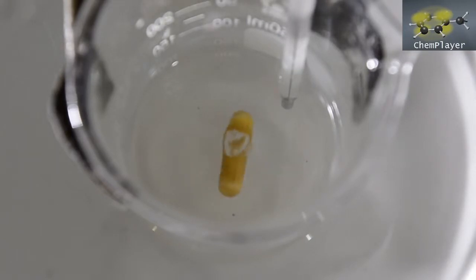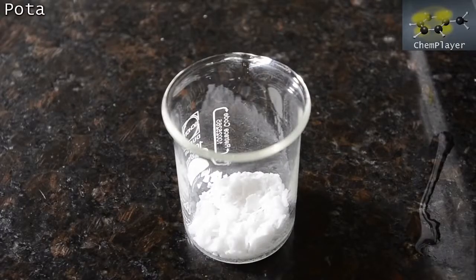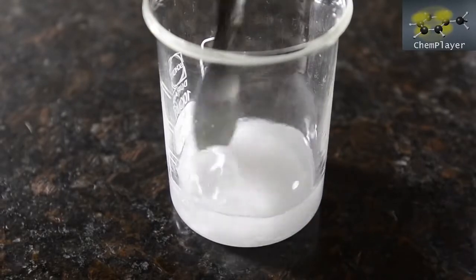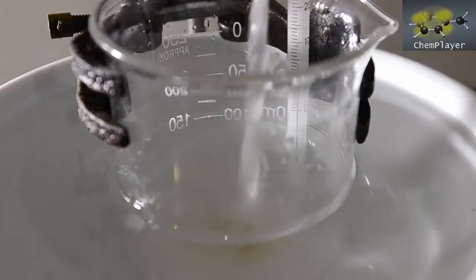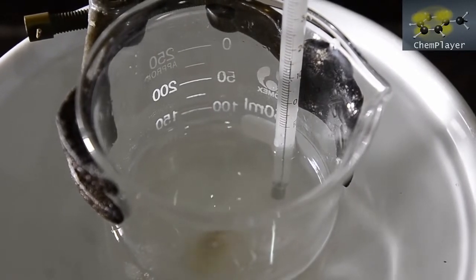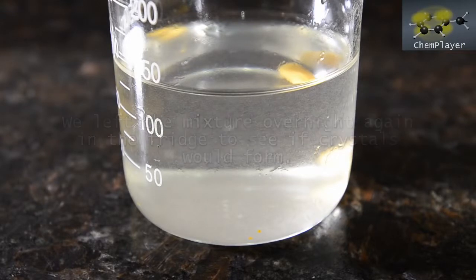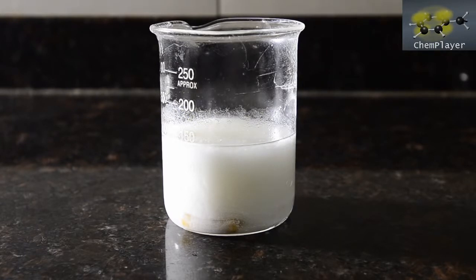We left the mixture sit for another 15 minutes whilst we prepared the potassium hydroxide solution. This time making up a solution using 15 grams of potassium hydroxide and a single ice cube. We chilled this down and then added to the chilled reaction mixture. It's now almost syrupy in texture with the amount of dissolved solids in. We left this overnight to chill in the fridge to see if it worked this time. Hooray! This time we've got a mass of crystals in the beaker. The texture is a bit like a gel.